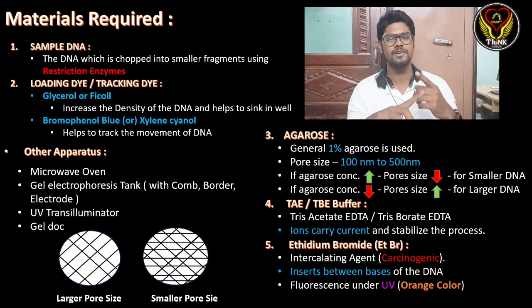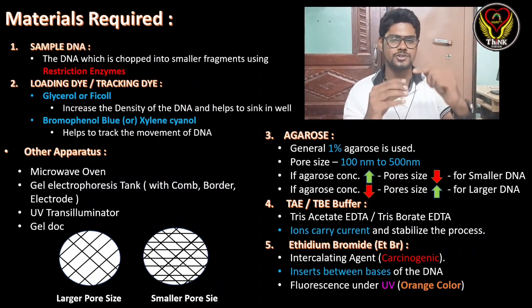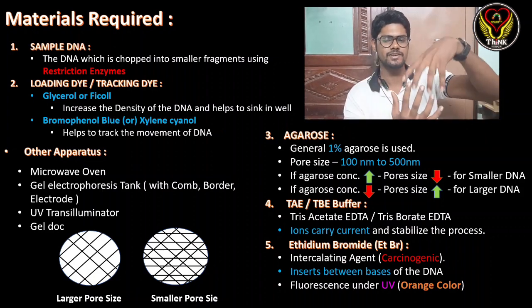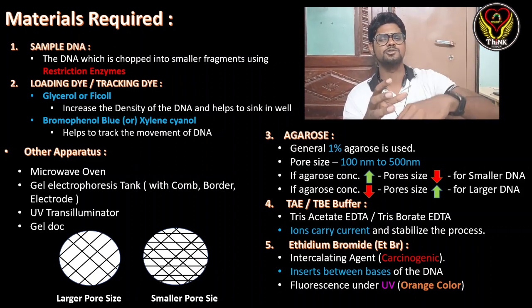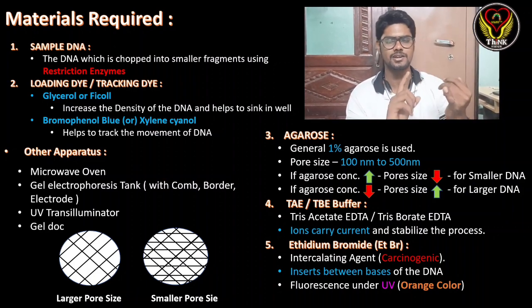The second important thing is loading dye or tracking dye. We will add glycerol or Ficoll. This will help with the density of the sample. Some DNAs will be very small, so they might not sink well and will float in the sample. We create wells in the agarose gel, and the sample has to sink into the well and should not float and come out. So to increase the density of the sample, we add glycerol or Ficoll.